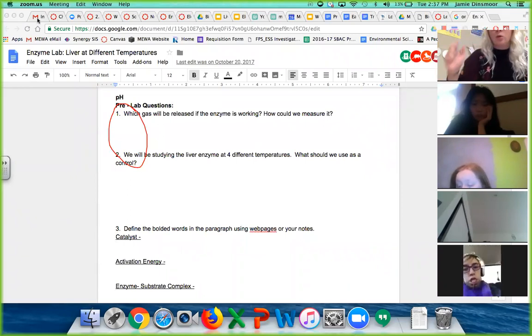All right, if you're just tuning in or you're confused, make sure you are looking at these pre-lab questions. You are attempting to answer questions 1 and 2 at the very least, also moving on to future questions. I'm just grabbing a few other supplies that we will be needing.